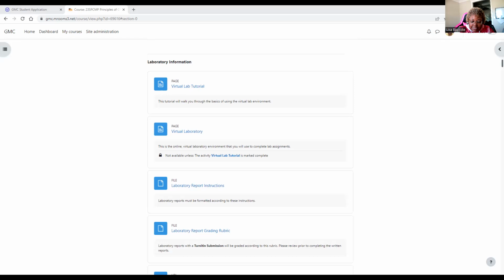So to determine the density of our solid, density is mass divided by volume. Okay. And so mass divided by volume, for our mass, remember we measured a mass of 5.6752 grams and our volume 0.50 milliliters once we have done our displacement. So what I want to do is I want to stop sharing this screen and share a whiteboard so you can see the calculation.